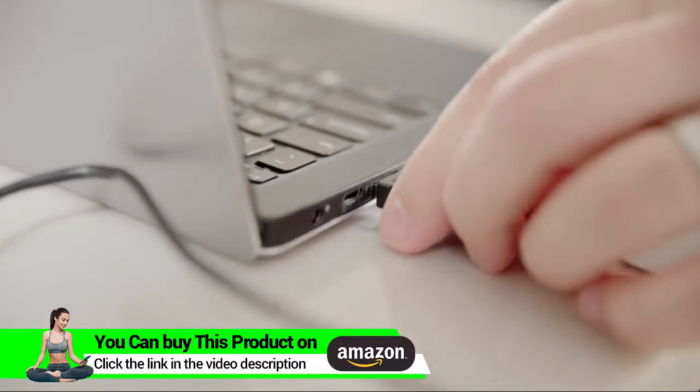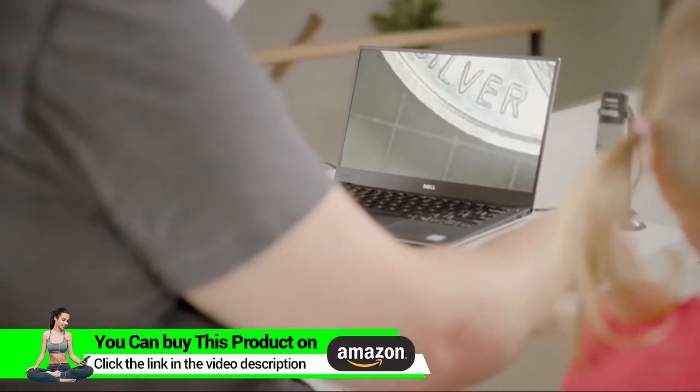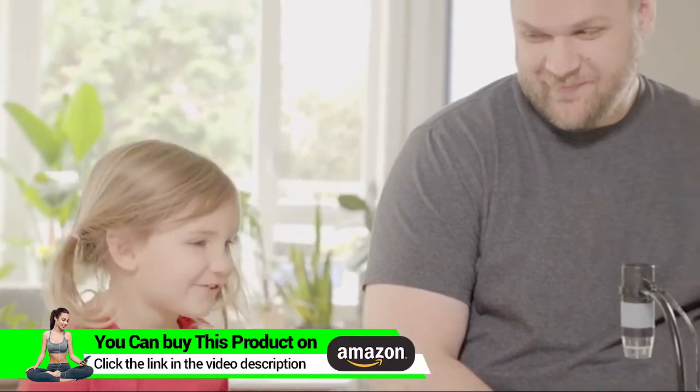With an easy plug-and-play experience, place anything on the observation pad and see things you've never seen before. With 2.0 megapixels and up to 250 times magnification, you'll be able to explore the world invisible to the human eye.